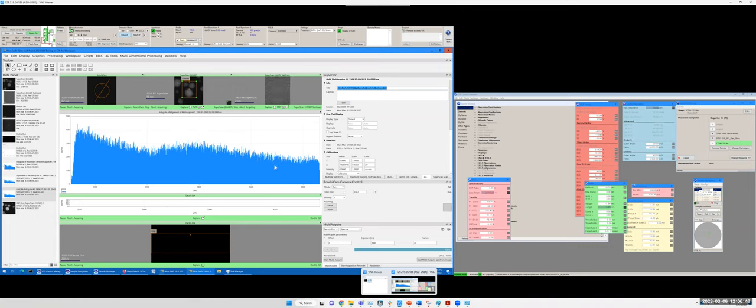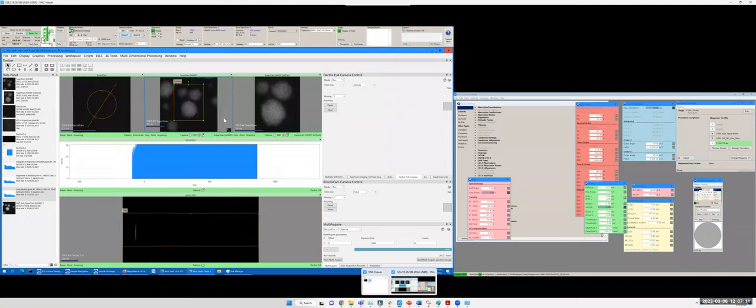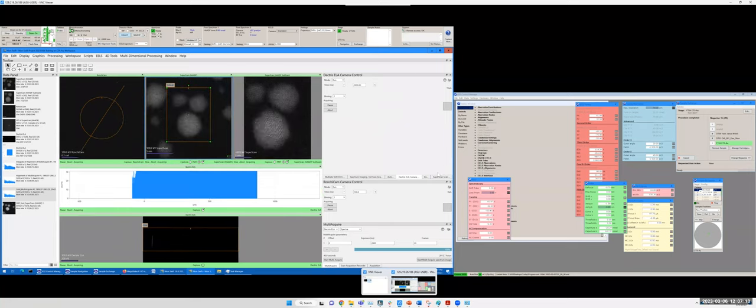Okay, now I want to do a quick EELS mapping. Because the gold signal is too weak, I will just do a carbon mapping. So I change back to zero loss so I can see carbon. I can see something, okay. So I also want to collect data from this sub-scan, right? You can see this is, oh, it has drifted, so we need to retake a survey image, right?